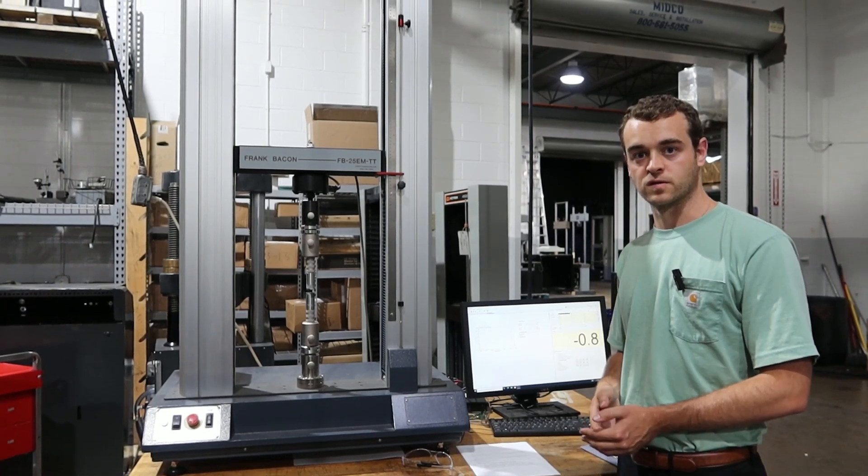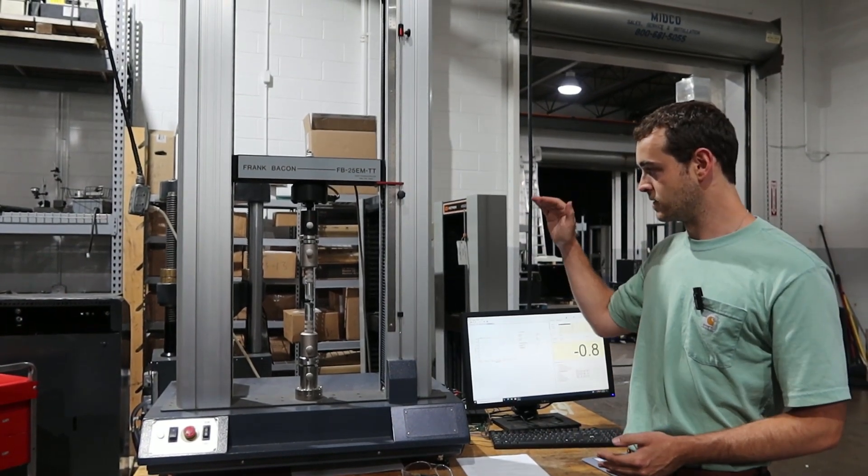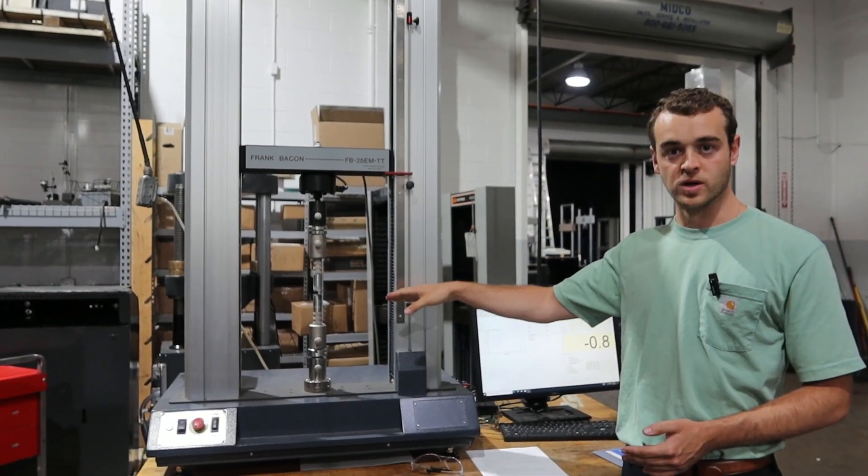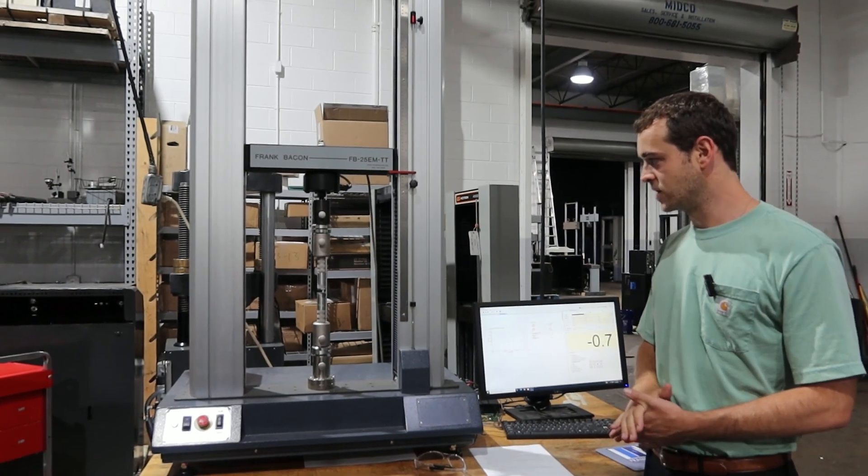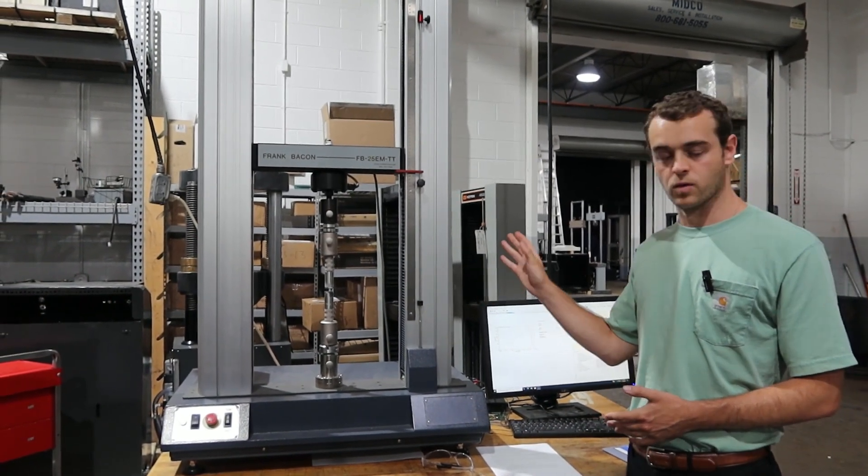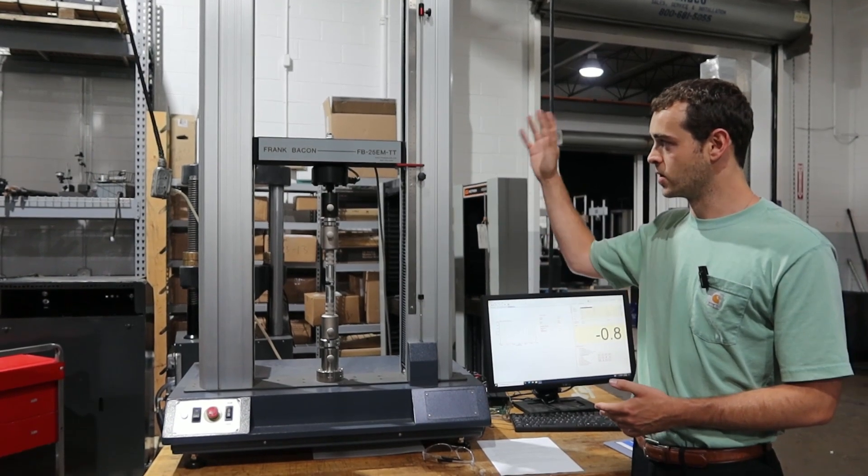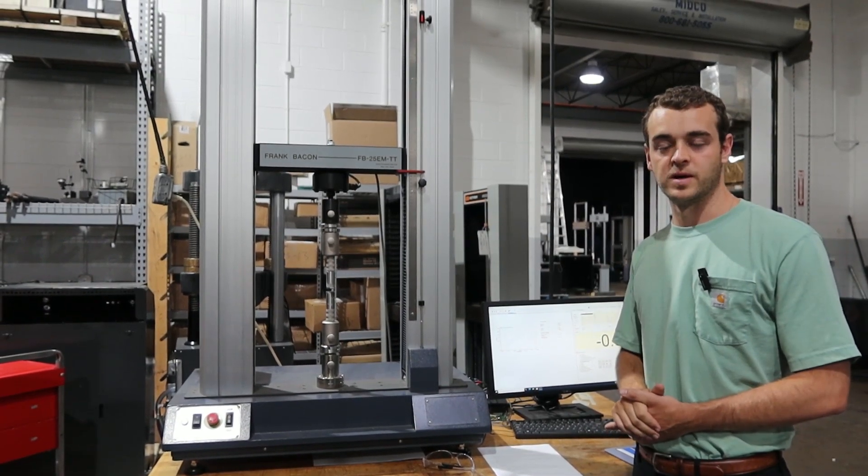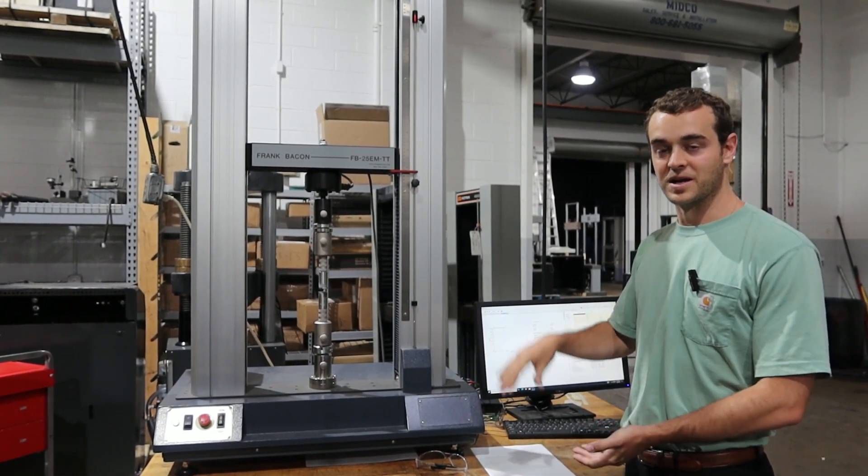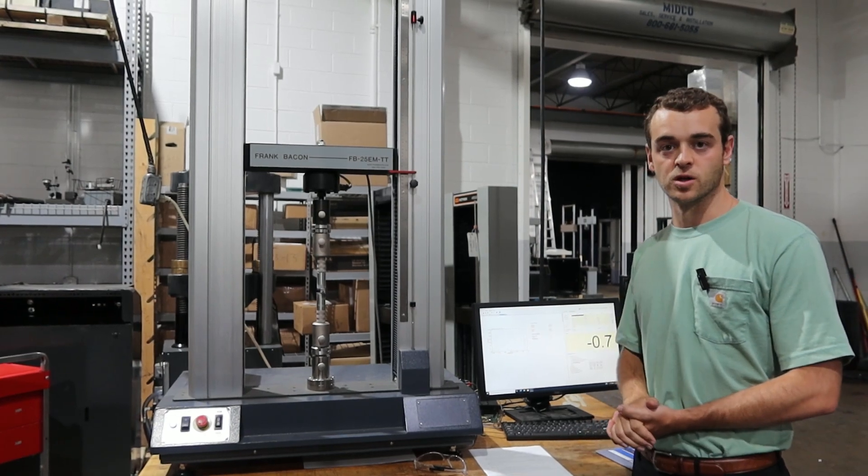So for ASTM C633 we can give you a full setup here with the appropriate tooling. Most of the time this tooling doesn't need to be rated anything over 50 kilonewtons. We're doing this on a 25 kilonewton Frank Bacon machine right now, but we have done them all the way up through 100 kilonewton systems.